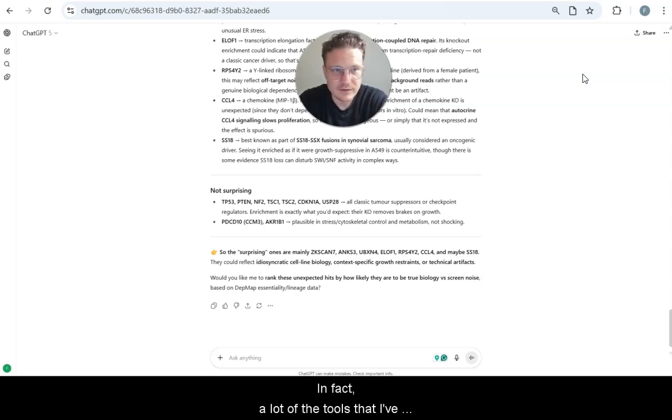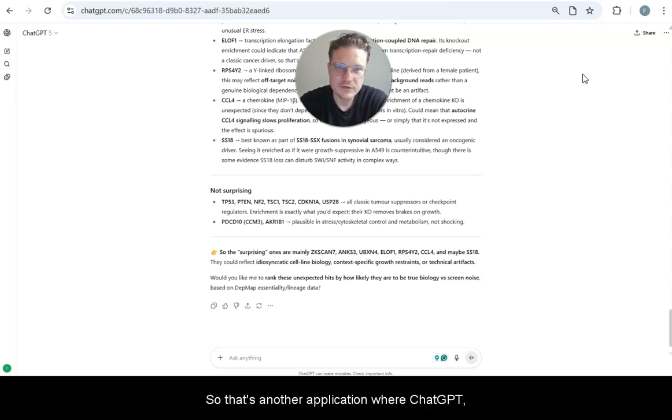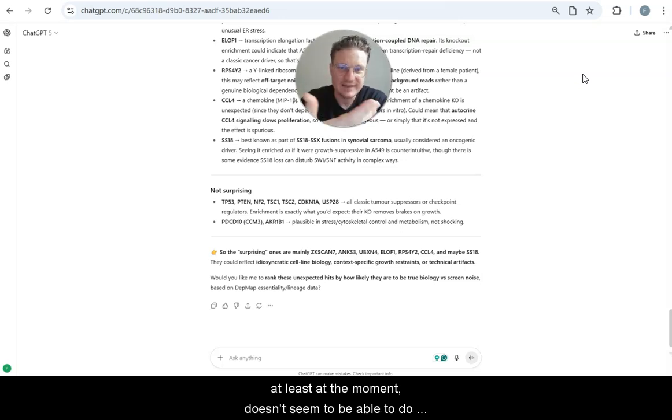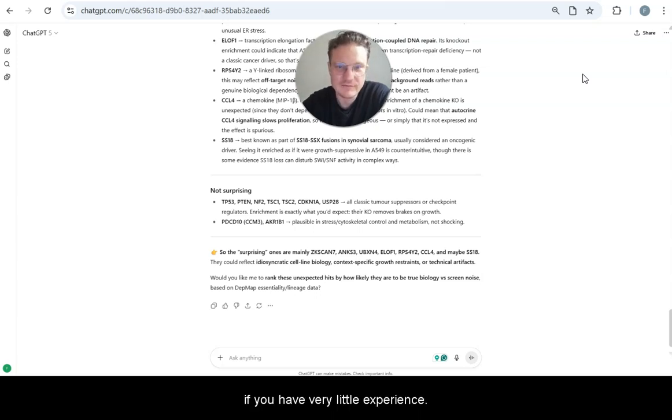And in fact, a lot of the tools that I've shown you in previous videos for CRISPR screen analysis actually could be done directly by ChatGPT. There will be a video after this where I show you how to use ChatGPT also for writing some scripts to do gene set enrichment analysis. So that's another application where ChatGPT, at least at the moment, doesn't seem to be able to do this analysis completely by itself. You can ask it to write code, and I'll show you how that can be done even if you have very little experience.